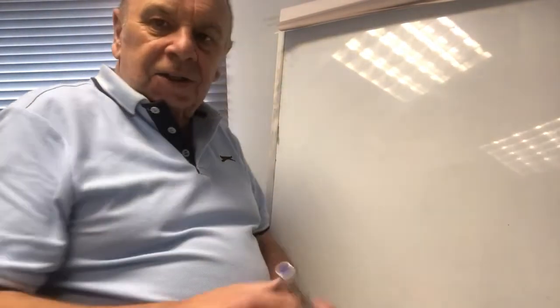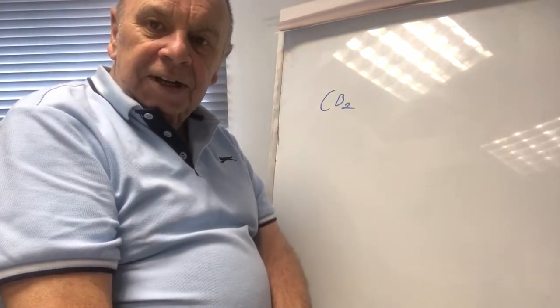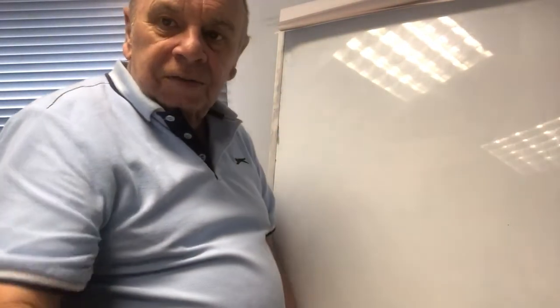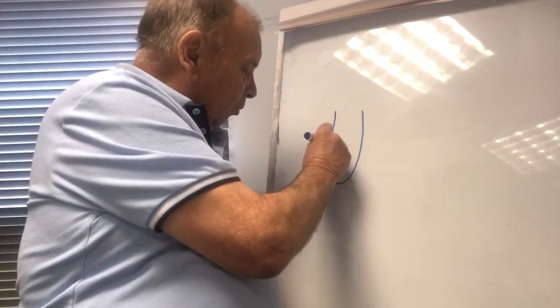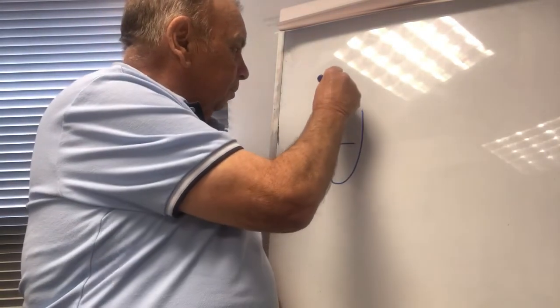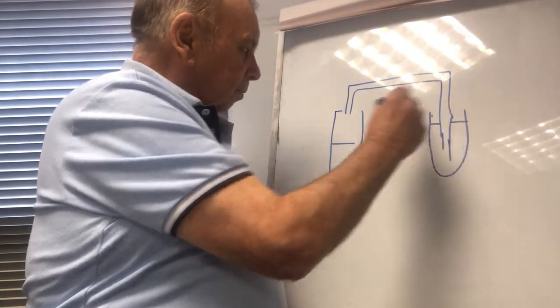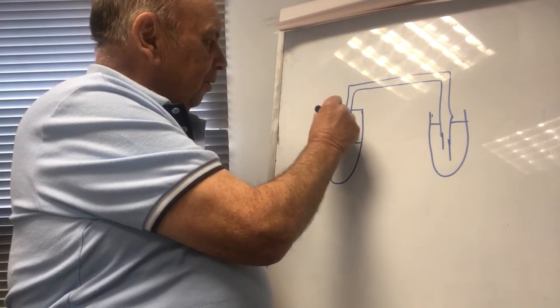And the next gas is a test for carbon dioxide gas. The test for it is if I pass that gas through a solution of lime water. By the way, lime water is a solution of calcium hydroxide, so there's my reaction. It's giving off a gas which I suspect is carbon dioxide. Great graphics, aren't they? Right.